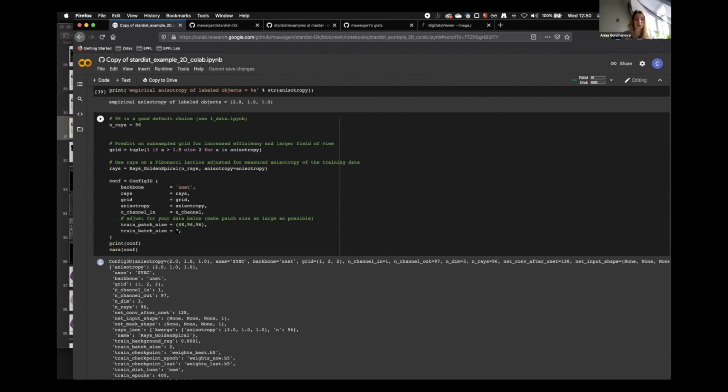Yeah, I already did batch size 1, but okay. Because if it doesn't fit, then you have to use the grid parameter. For your case, I would just use grid 4. Oh, maybe that would be better. Yeah, because you have very large objects, so it doesn't matter. A small patch size doesn't work for my data, but a grid size would be a good solution.